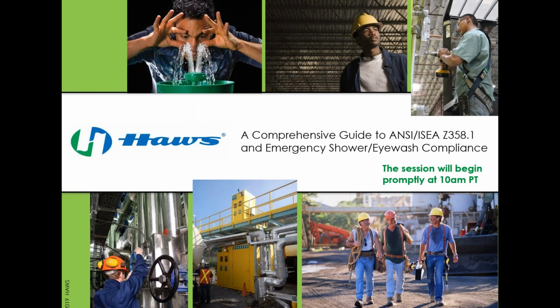This is a comprehensive guide to ANSI and ISEA Z358.1, 2014, and emergency shower and eye wash compliance. Thank you very much for being here. We greatly appreciate it. We're going to go over a lot of great information today, and hopefully let you leave with some tools that will help you with your own compliance and knowledge when it comes to emergency eye wash and shower safety equipment.